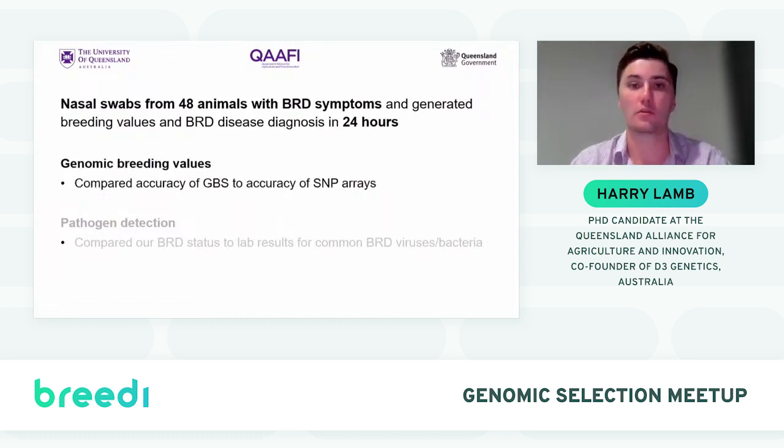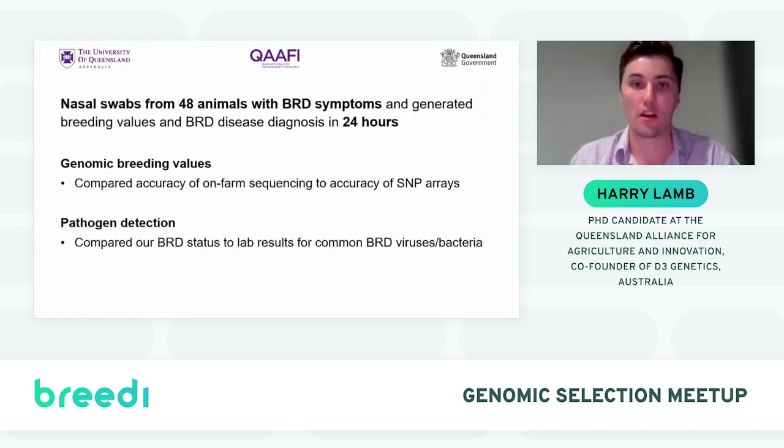For our genomic breeding values, we wanted to check that we were actually delivering accurate breeding values. So we also sent some DNA off to the labs to get our official Australian breeding values for these animals, and then compared our Australian breeding values to the breeding values we could generate on farm. Next slide, please. For the pathogen detection, again, we wanted to check that we weren't just picking up any bacteria or viruses for these samples. So we also sent the bacteria and viral DNA away to a lab to double check what results we were getting from the lab, and then compared those results to the results that we got on farm. Next slide.